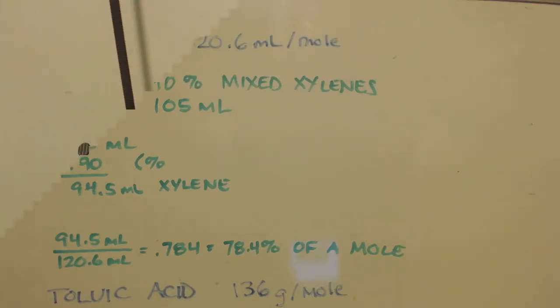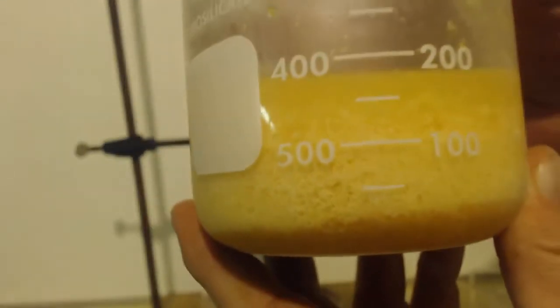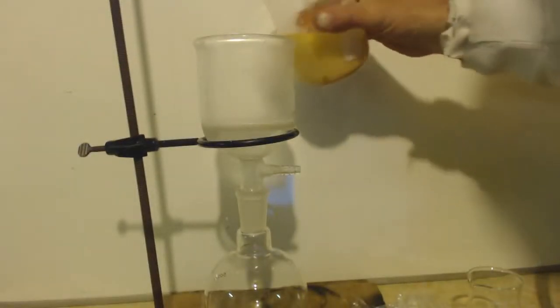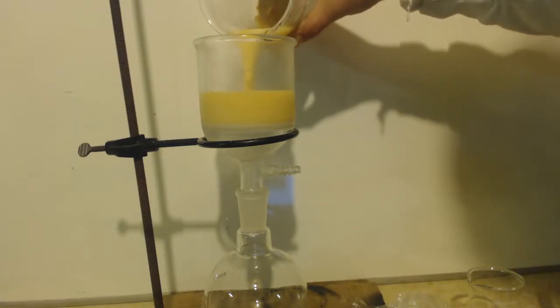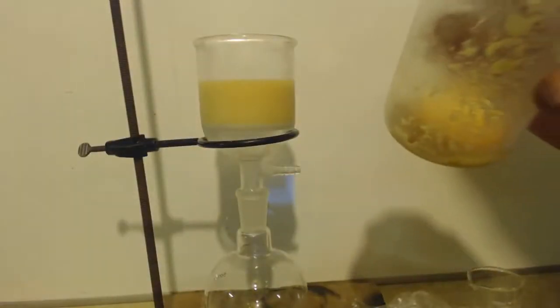This is part 4. You can see it's nice white crystals or whatever. Well, maybe white yellow. So I want to pour them in here, filter it through. Now there's some crap at the bottom. I don't know if you can tell the color, but it's brown actually. I might just leave that in there.